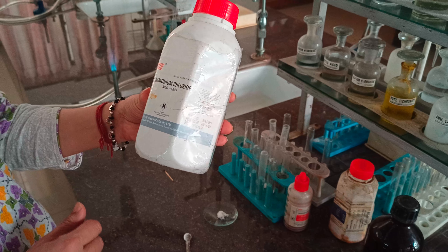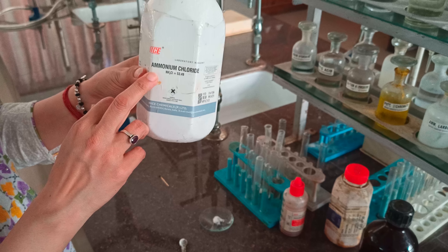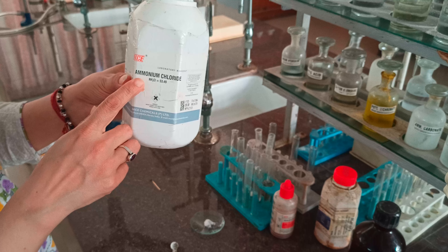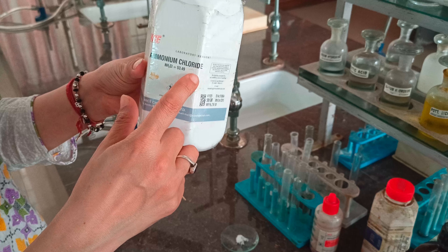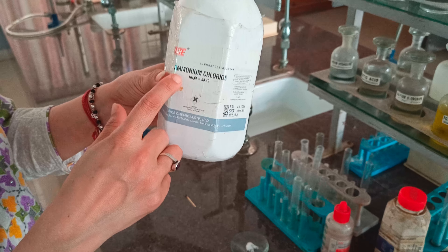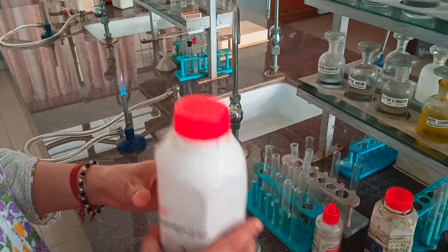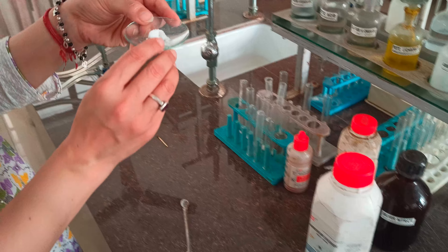Hello everyone, today we are going to discuss the salt ammonium chloride. The cation is ammonium and the anion is chloride ion. We will identify and confirm the same. For this, the first step is to take the salt.